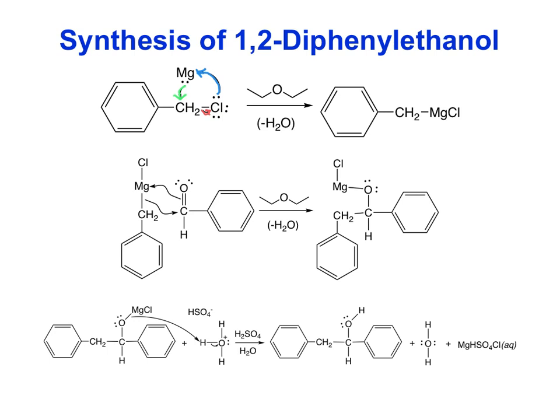And so we end up then with our benzyl magnesium chloride product. Let me write that down for you. Benzyl magnesium chloride.